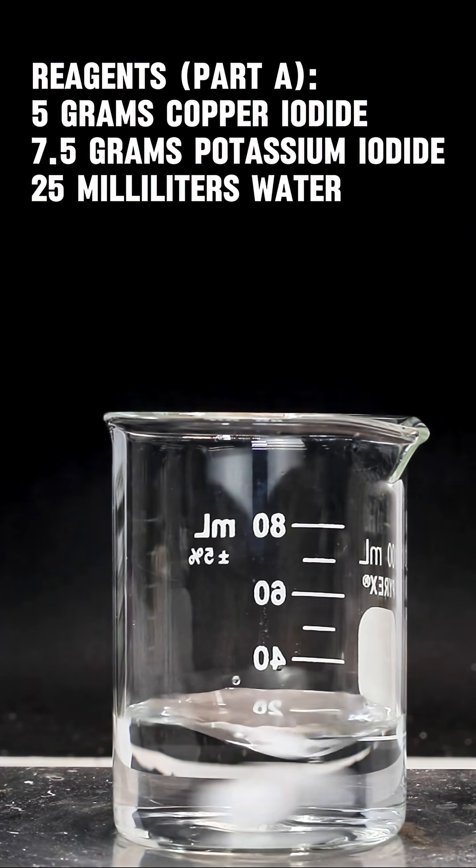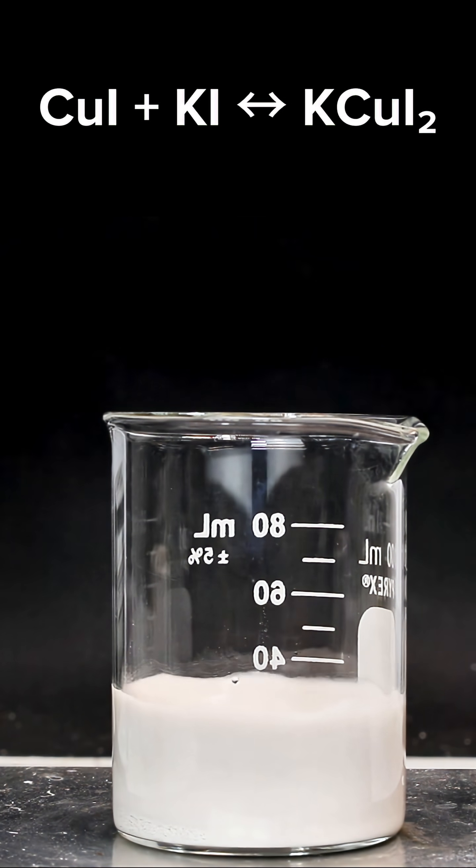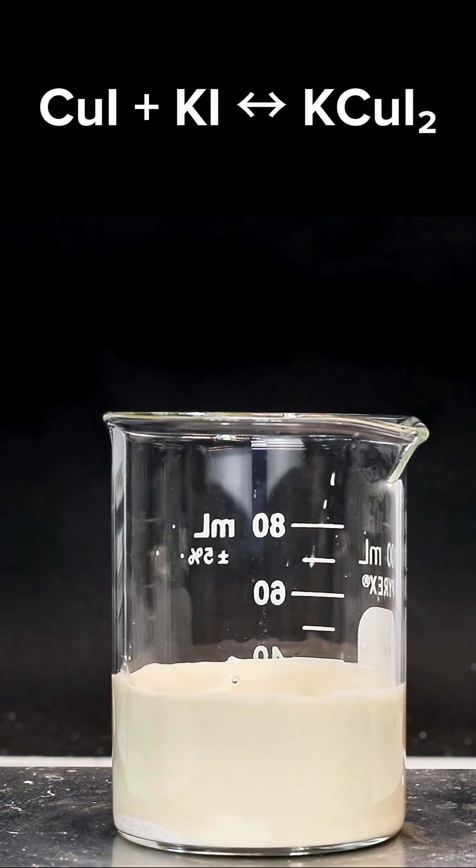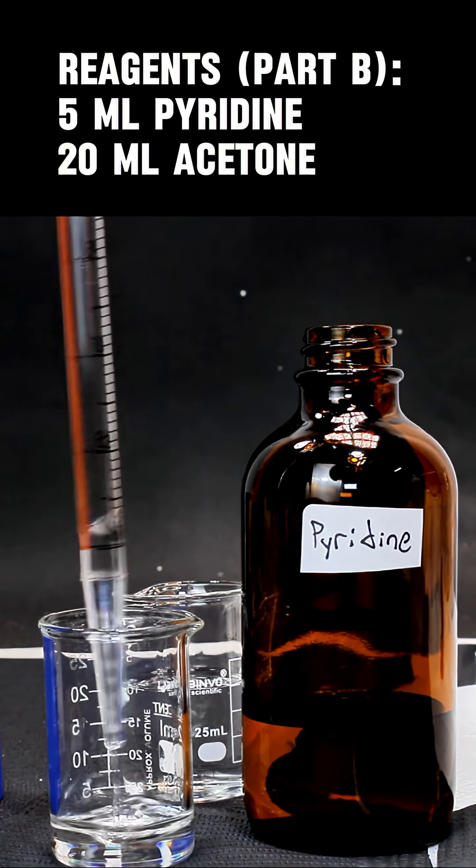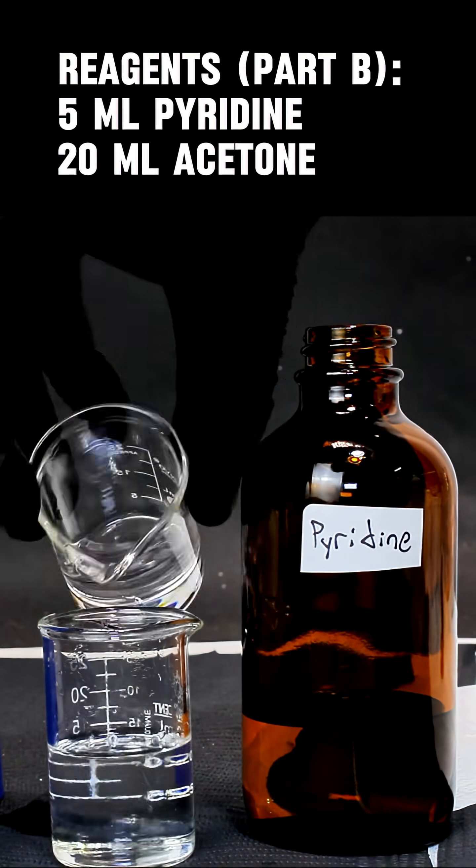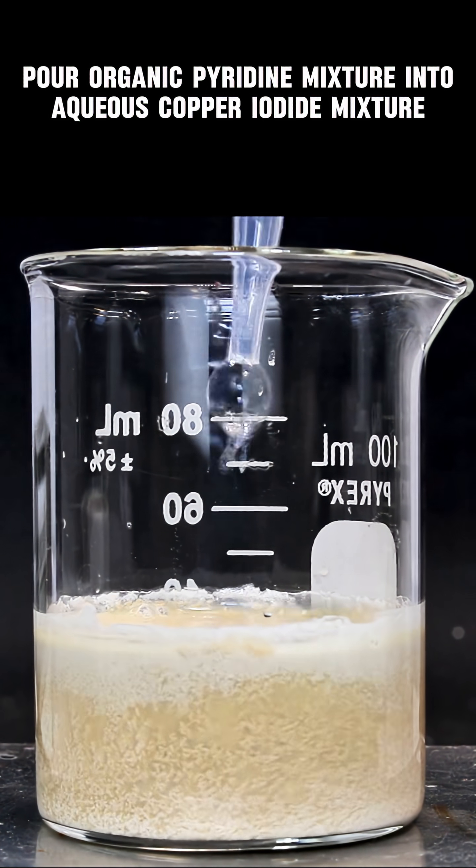This is part A of our mixture. For part B, combine one part pyridine with four parts acetone. Now for the final step, pour the organic pyridine mixture into the copper iodide mixture and the product will immediately begin to form.